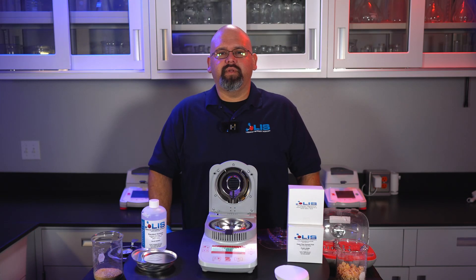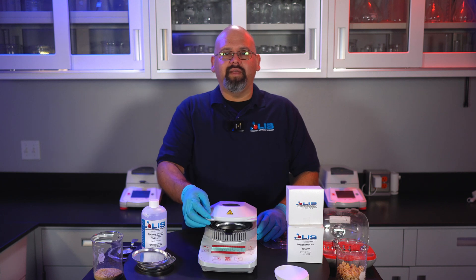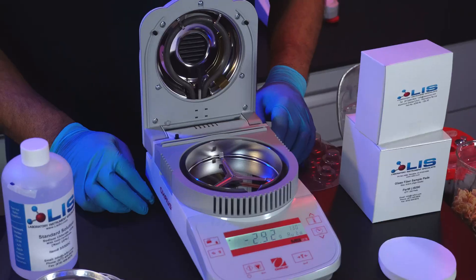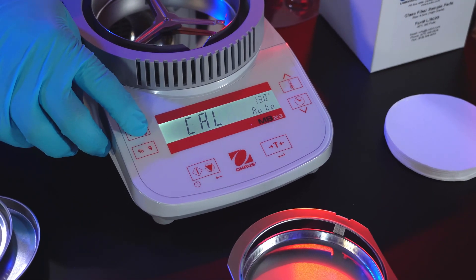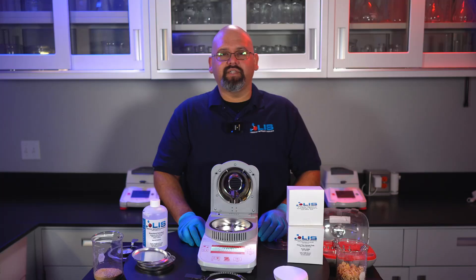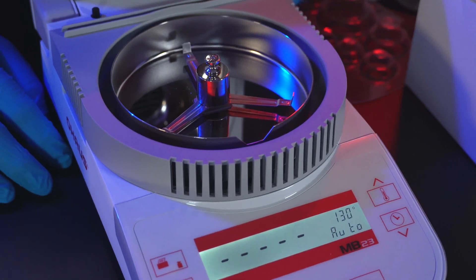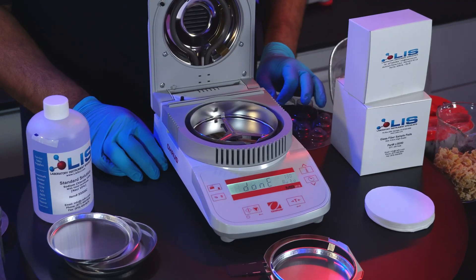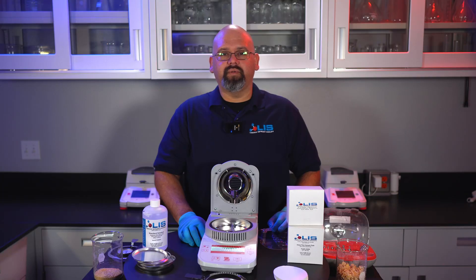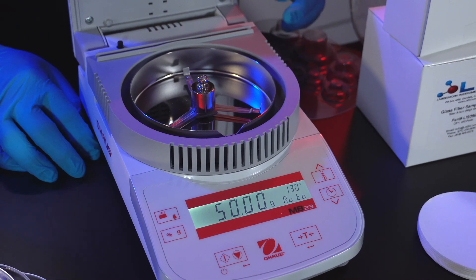To properly calibrate the instrument, you will need a precise calibration weight and temperature calibrator. Both items are sold on our website. The MB-23 is very simple to calibrate. Open the lid and remove the aluminum dish. Press the tear button to zero out the scale weight. Press and hold the print button, which is also the calibration button. Once it reads cal, let go of the button, and it will then flash 50 grams. Take the 50 gram weight and apply it. Remove the weight when the display flashes zero. The display will flash done and go into its normal weighing mode. You can now apply the 50 gram weight to verify that the scale reads exactly 50 grams.